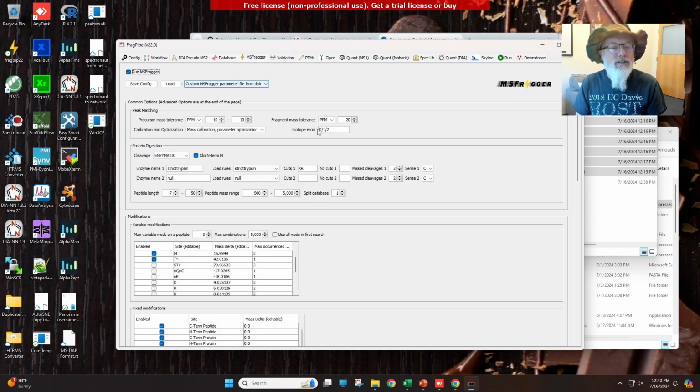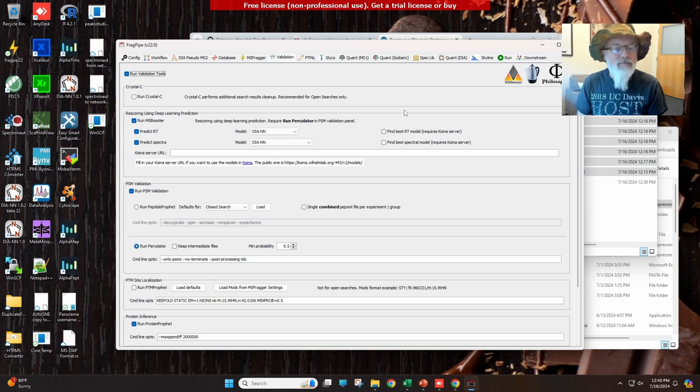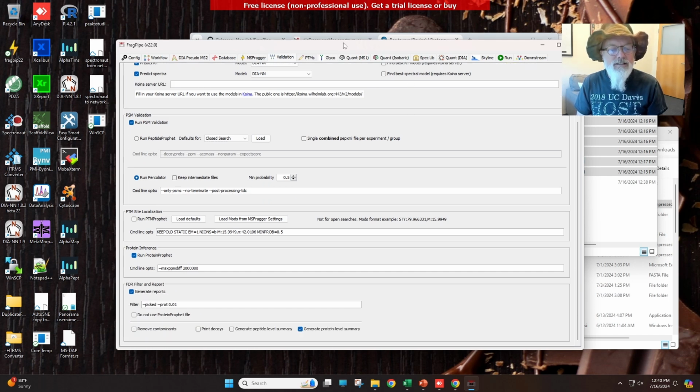Let's see, MSFragger, we're going to leave all other default things the same. We're not going to change any of these.